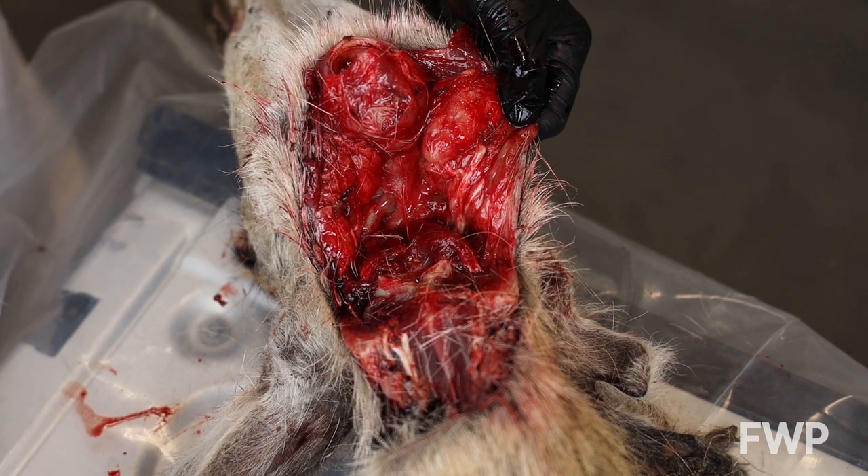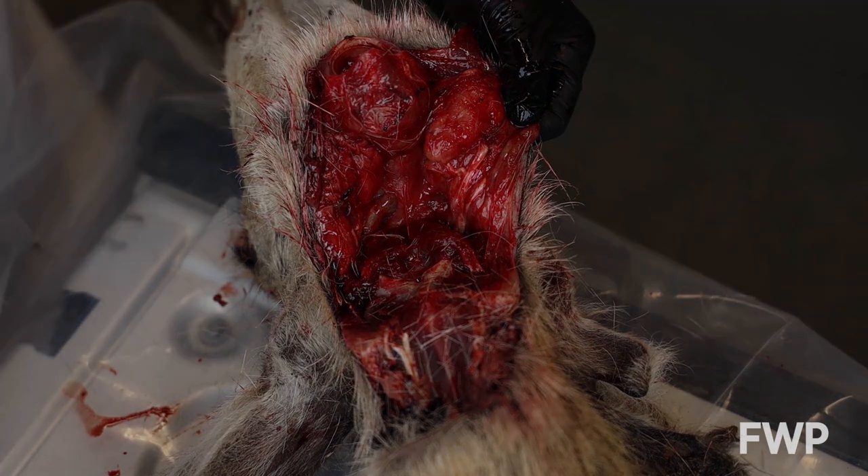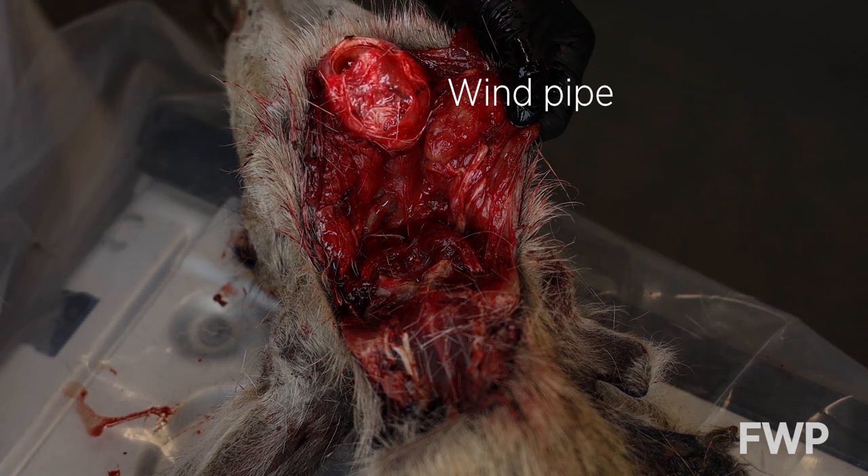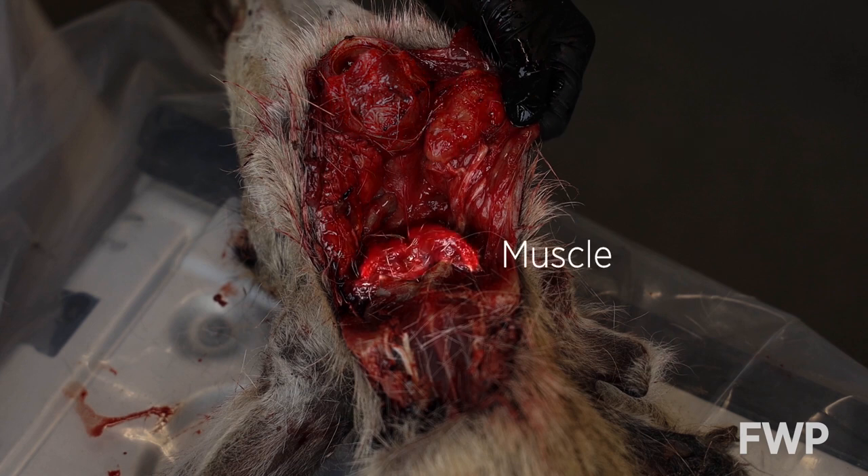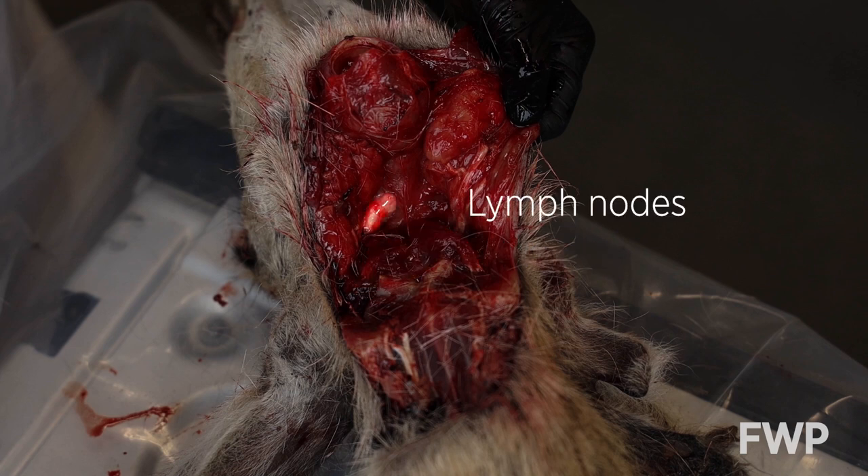With the incision open, you'll see several organs that will help you find the lymph nodes. At the top are the windpipe and larynx. Below them are two salivary glands. At the bottom of the incision are small muscles. The lymph nodes are generally found between the salivary glands and the muscles below them.